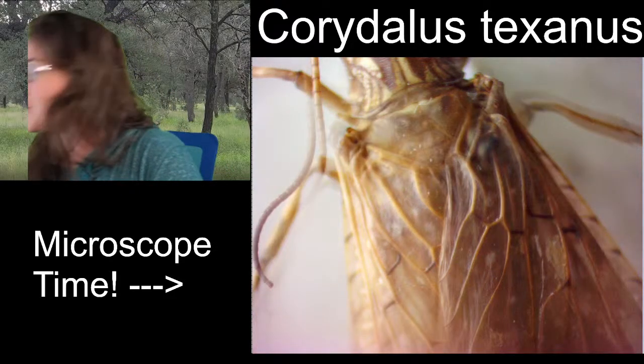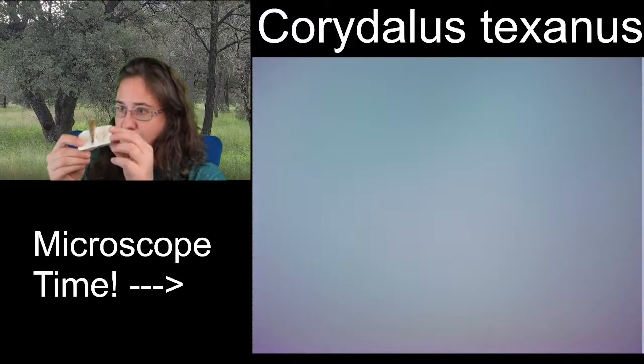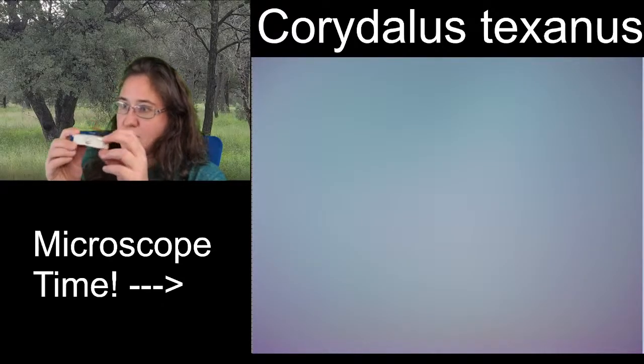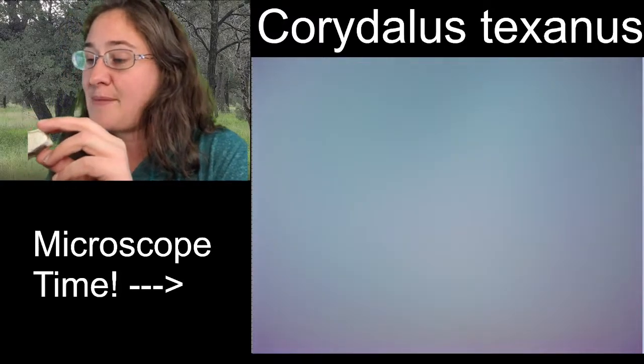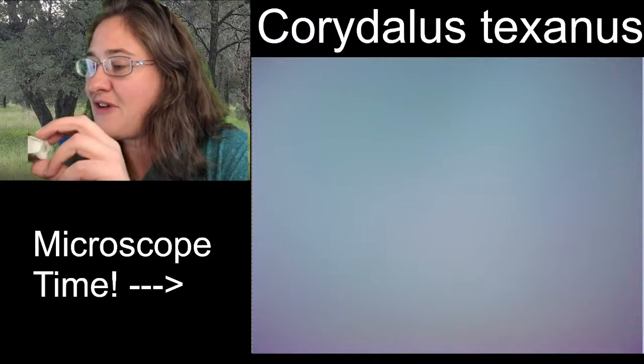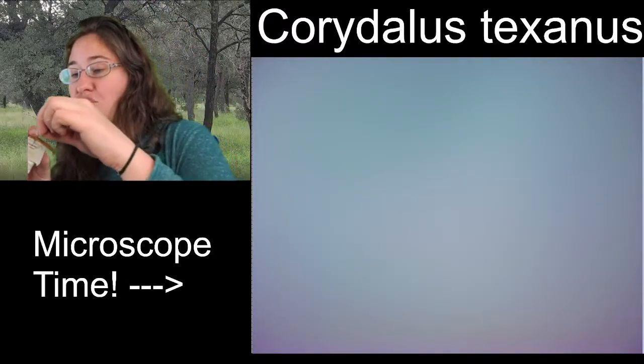Now, the hind wings are not going to be super visible. The hind wings are not visible from the top. And even if I... Oh, I can show you this.